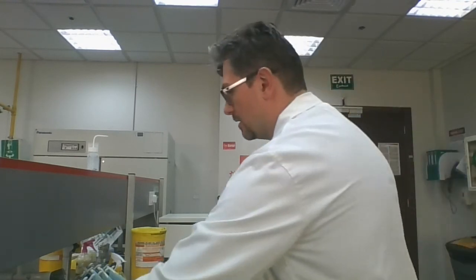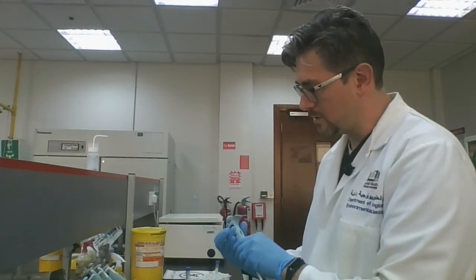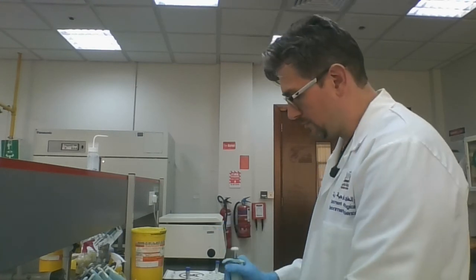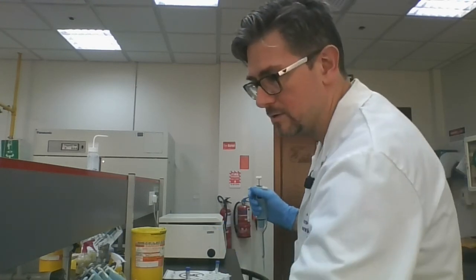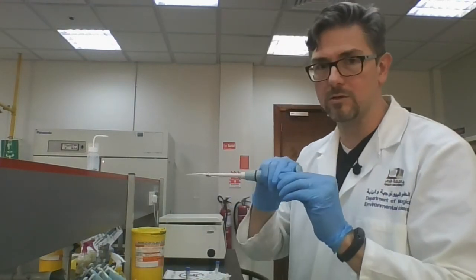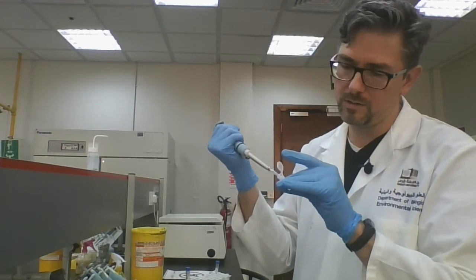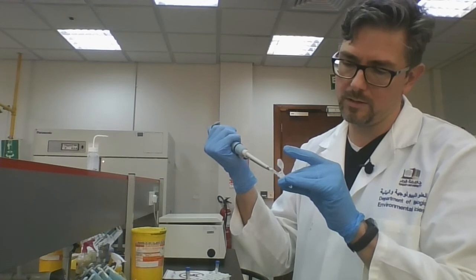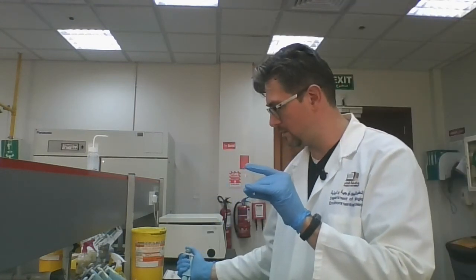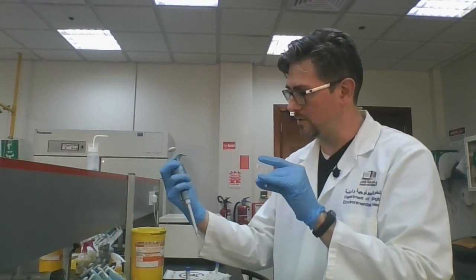Okay, so I'm going to take the yellow tips for this. I have set my P200 to 200 microliters, and then I will change the volume to 150 after that. So I will take out this epitube here. I already have fresh epitubes ready in my epitube rack. I just need to remove the aqueous phase, so I will do that as carefully as I can and transfer this into my tube A. I'm going to change this to 150.